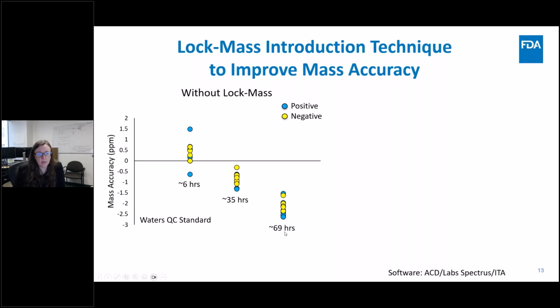But over time, this does drift. If you had a really long queue, which queues for non-targeted analysis tend to be very long, you often have, or you should, not everyone does all of these QA/QC processes that you should, replicates for each sample. Often there are a lot of samples because you want a statistically significant number of samples to be able to do some of the data processing and analysis on the back end. And so these can be really long queues when including proper QA/QC procedures.